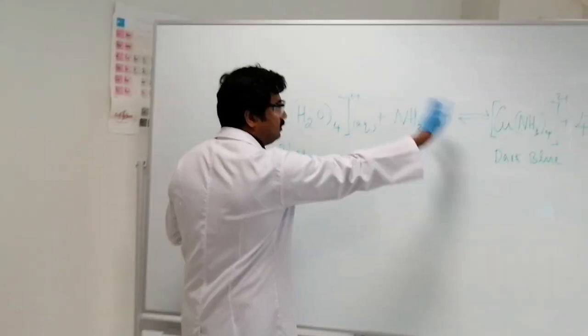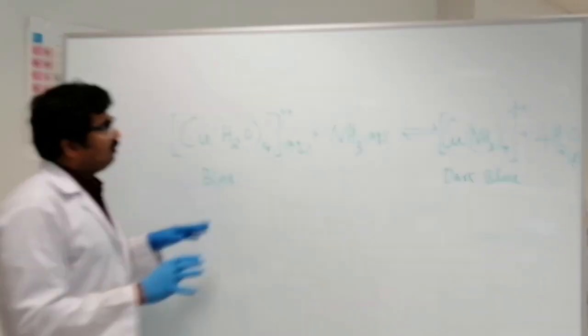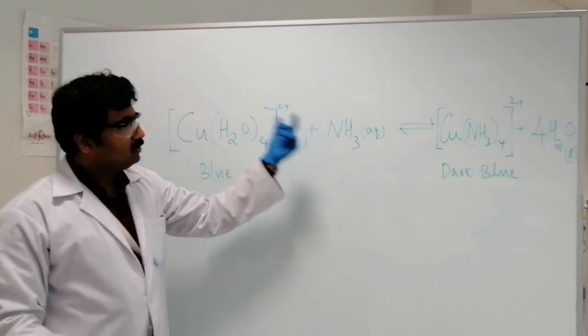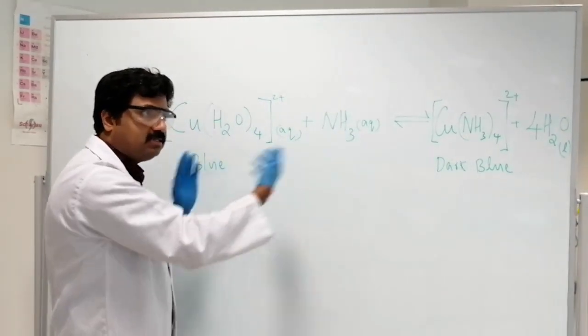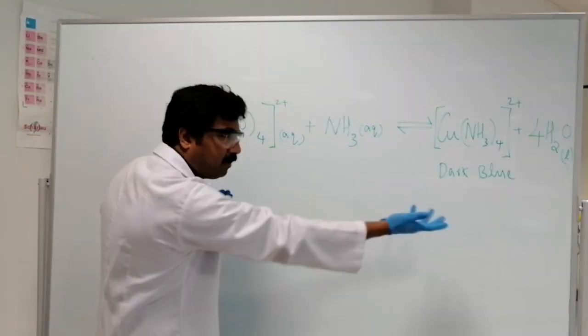So as we have seen, this is the equilibrium reaction that we dealt with right now. So what I did here is, after establishing this equilibrium, I added HCl into the test tube. You know that as this is an equilibrium, both forward and backward reactions take place at the same rate. So in your test tube, you have both reactants and the products.